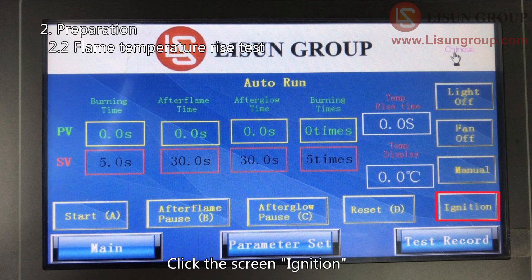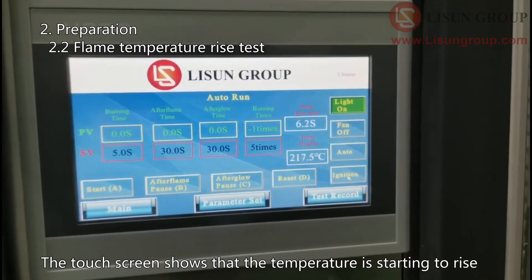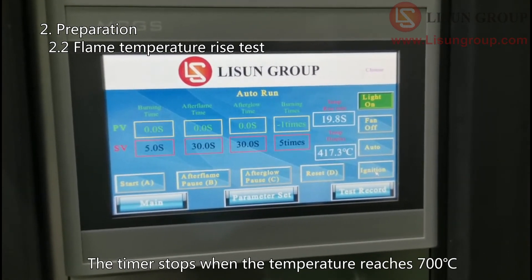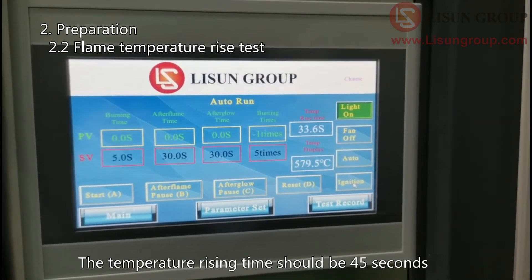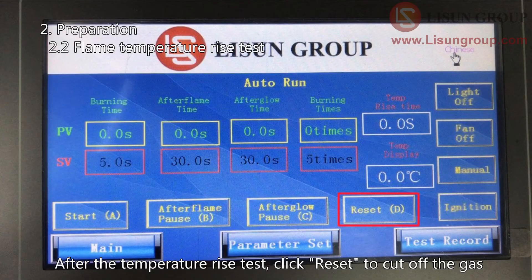Click screen Ignition. Then move the flame to the thermocouple. The touch screen shows that the temperature is starting to rise. The timer starts when it reaches 100 degrees Celsius and stops when the temperature reaches 700 degrees Celsius. The temperature rising time should be 45 seconds according to the standard, and the error should be less than 1 second. After the temperature rise test, click Reset to cut off the gas.